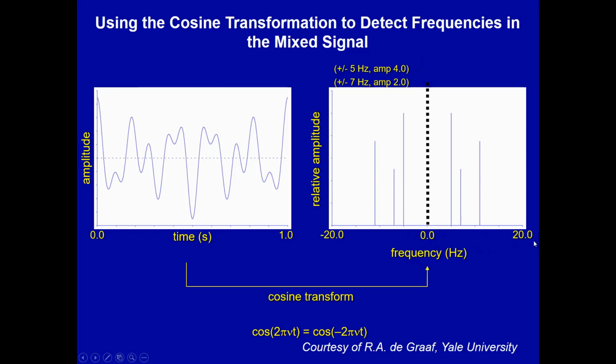See, we have positive frequencies on the right and negative frequencies on the left. I mean, who ever heard of a negative frequency? When you turn on your radio, you set it to maybe 90.5 megahertz around here, or 107.9 megahertz, depending what kind of music you like. And you don't have negative frequencies available on your radio dial. That's because we have this rotating frame concept.